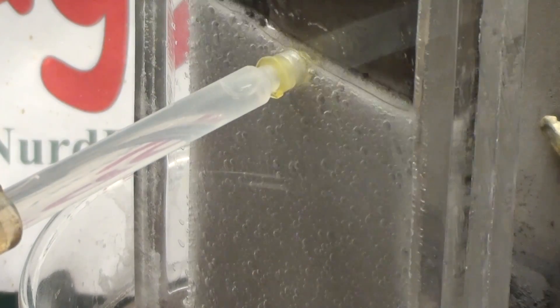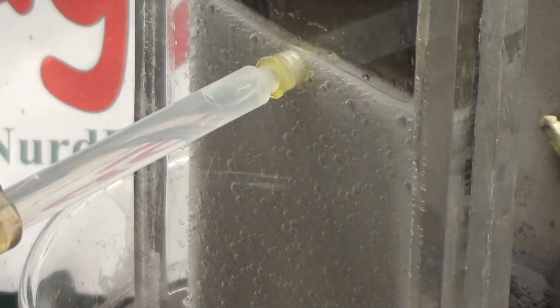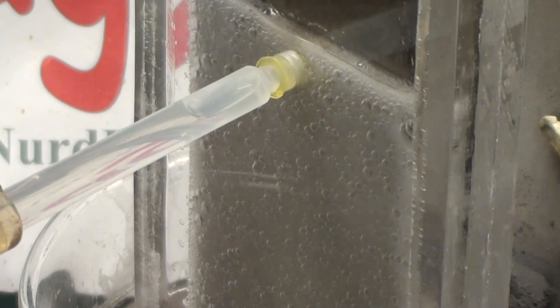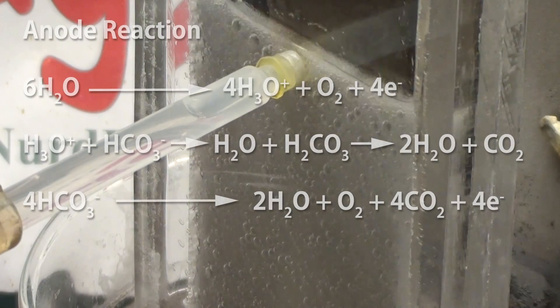In a commercial cell they use such high currents that they can exceed the osmosis rate and need to directly pump in water themselves to dilute the sodium hydroxide and prevent it from precipitating.